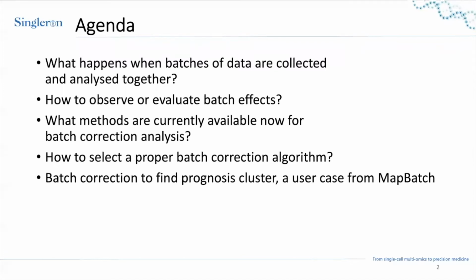So a lot of times, as researchers, we will need to collect multiple sets of data from single cell experiments and then conduct the downstream analysis.